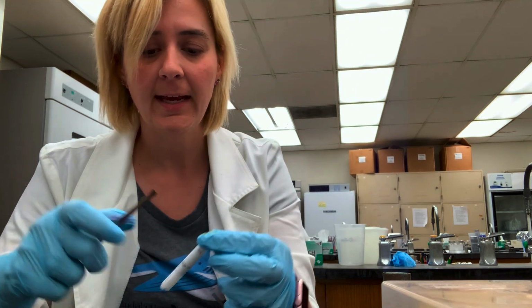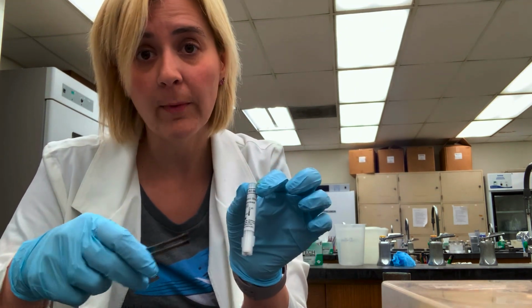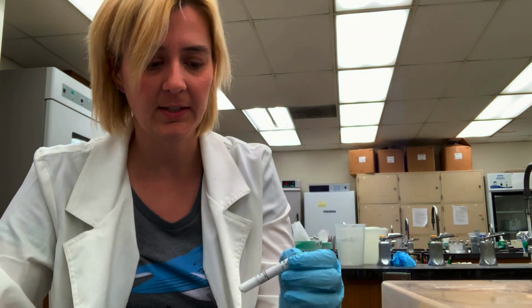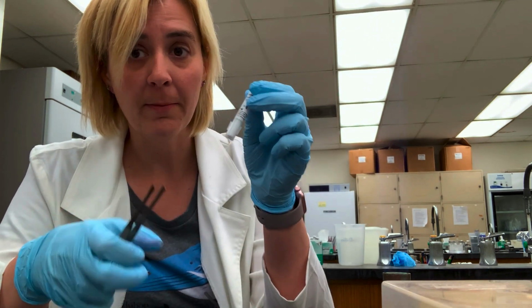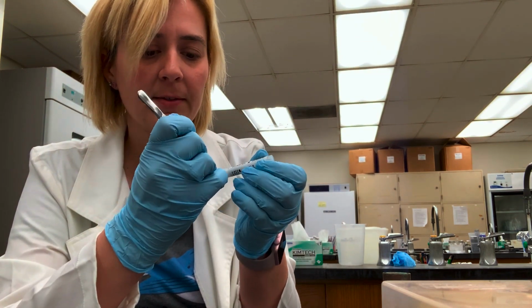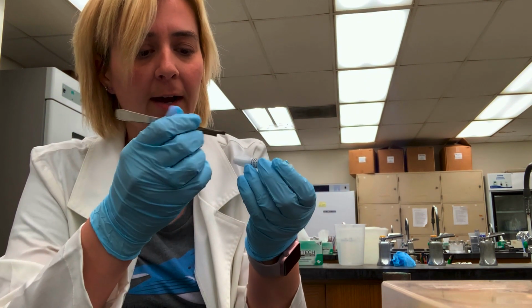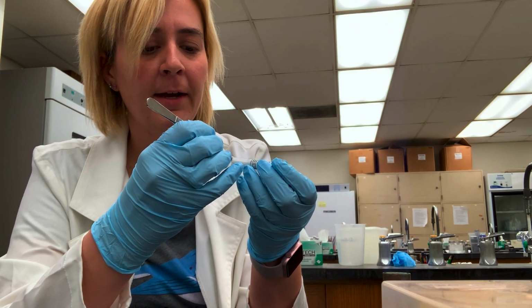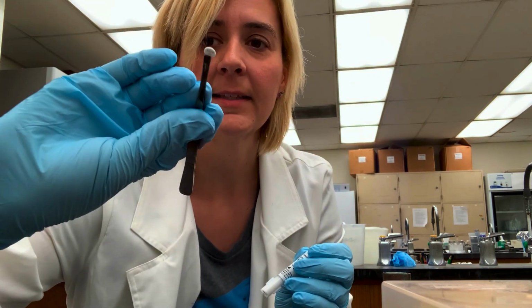So the next step is we are going to take discs that are already saturated with our antibiotics. So I have some forceps. I'm going to make sure those are sterile. This antibiotic is called meropenem. And so what I'm going to do is use my sterile forceps to push out a disc, this disc in particular contains 10 micrograms of meropenem. The disc is labeled on one side. I will put that on my lawn. And so what I'm going to show you when I'm done is what the lawn looks like.